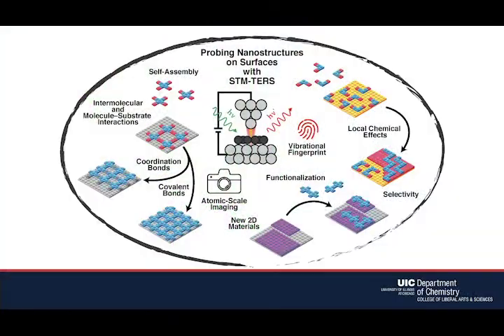In all respects, bottom-up fabrication methods that use self-assembly on a surface are governed by the interplay between intermolecular and molecule-substrate interactions. As shown here, with a bit of a caricature, a well-defined view of the intricate interactions between adsorbate molecules or materials and their chemical environments enables atoms, molecules, and even low-dimensional materials to be viewed as akin to Lego building blocks.